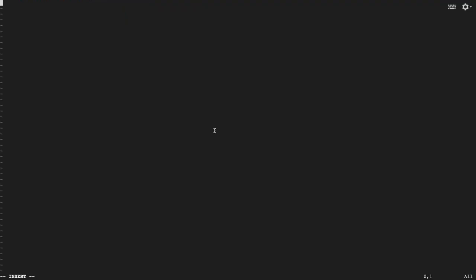All right, and just like with the Ivar wrapper, the first thing I'm going to want here is a small shebang statement to make sure that this is executed as a shell script. And then I'm going to define the two positional user input variables, the first of which being MAFFT input. So this is the multi-FASTA input file, and again, this is just the first positional argument. And then the second is going to be the expected output file name and path. So in this case, we'll call this MAFFT output, and that will be the second positional argument.